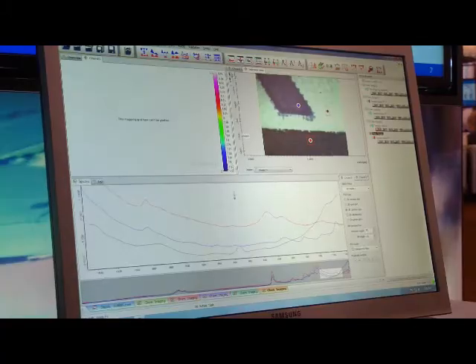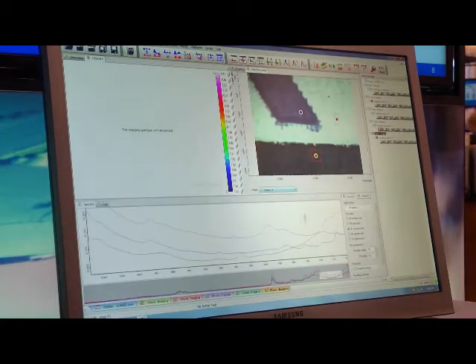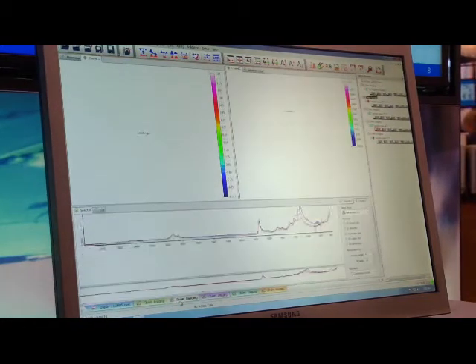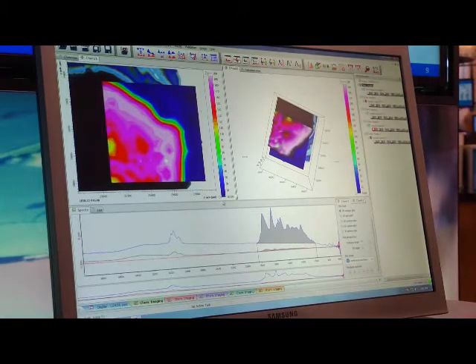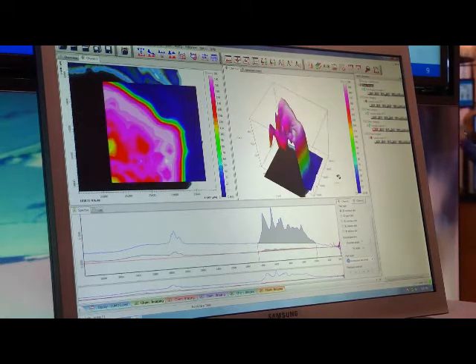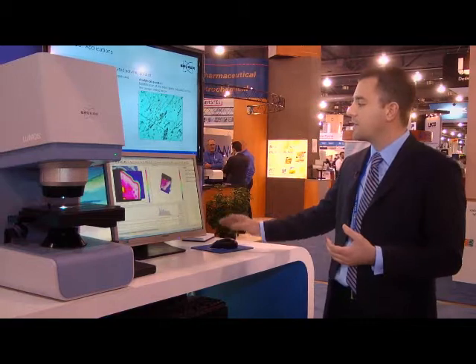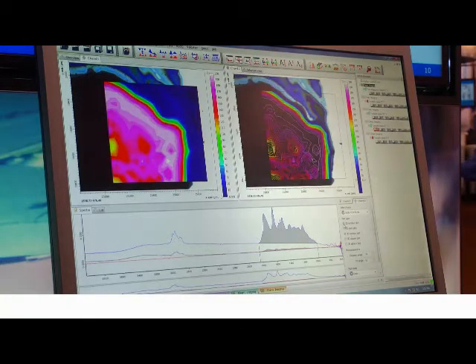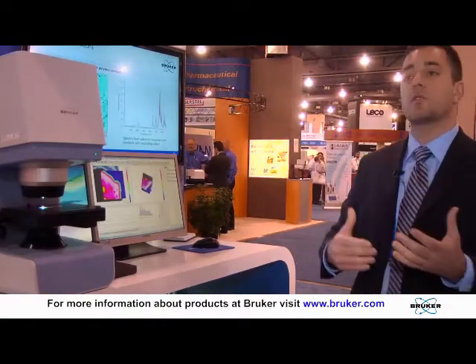And now we're able to look at the three distinct peaks that our blue, our black, and our white paper are able to give us. And you can see the beautiful specificity that our blue, black, white ink give. We have tremendous signal to noise. And if we were able to collect a larger map, say something like this one here, we would be able to integrate over a larger area. And here you can see the high concentration of our different chemical regions. So you're able to actually get chemical mapping by doing larger areas with lower spatial resolution.